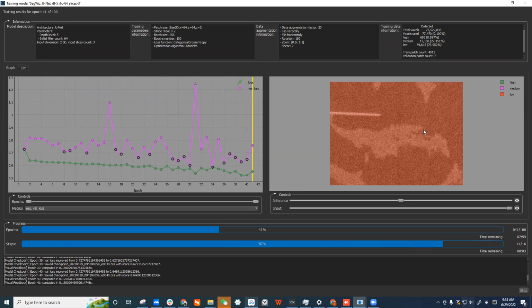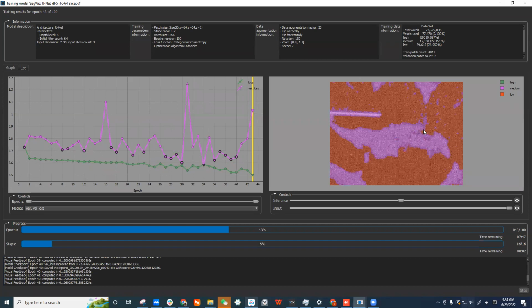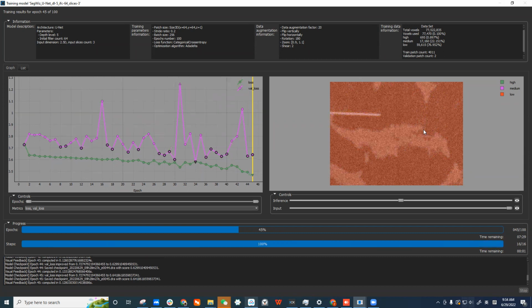There are some concerns we have to take into account in the beginning. For example, the intensity calibration, how we pre-process the image, and how we choose the best image plane to use for deep learning. There are many issues to consider. Not every one is critical for every case, but we have to learn all of them to get the experience.